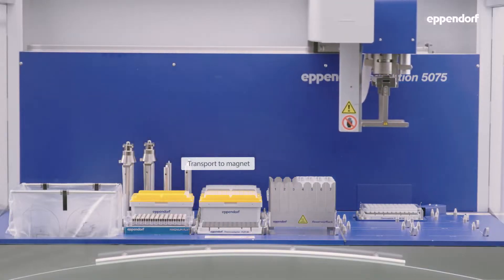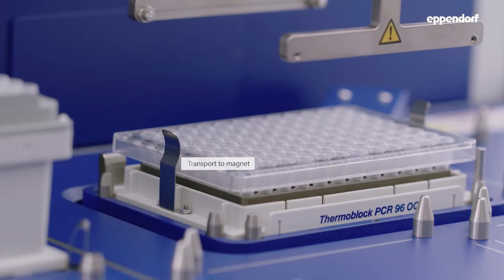The sample plate is then transported back to the magnet for the separation of nucleic acids and beads.